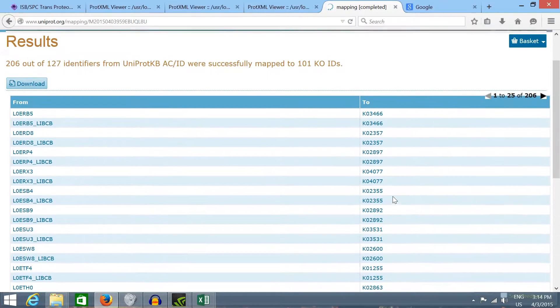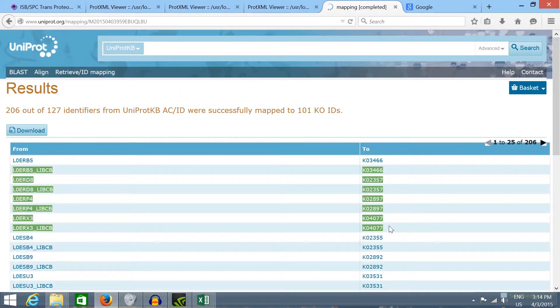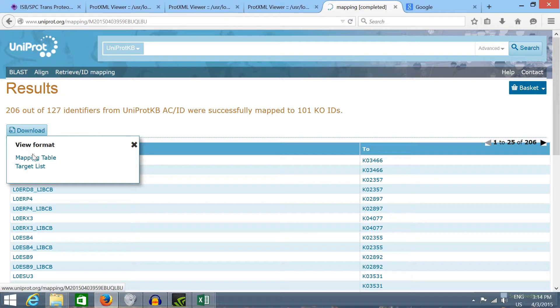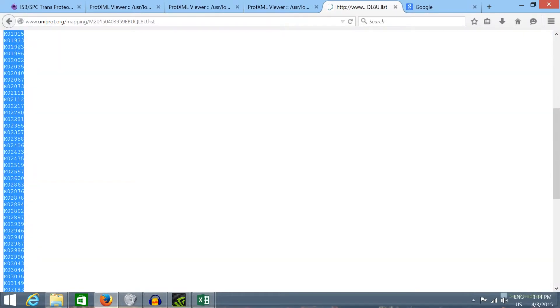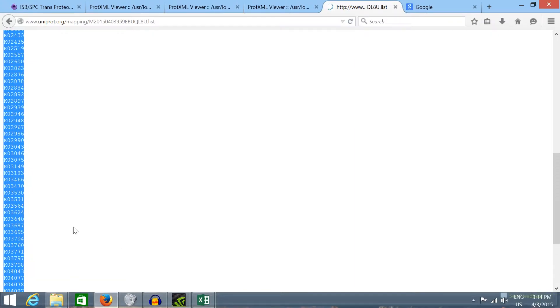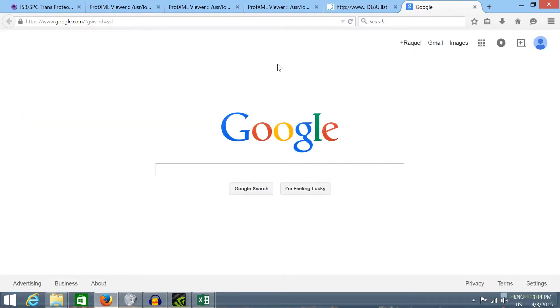This should be the mapped IDs. If we click on download and target list we're going to have all the converted IDs. Now we can copy these IDs and go to the metabolic pathway database.